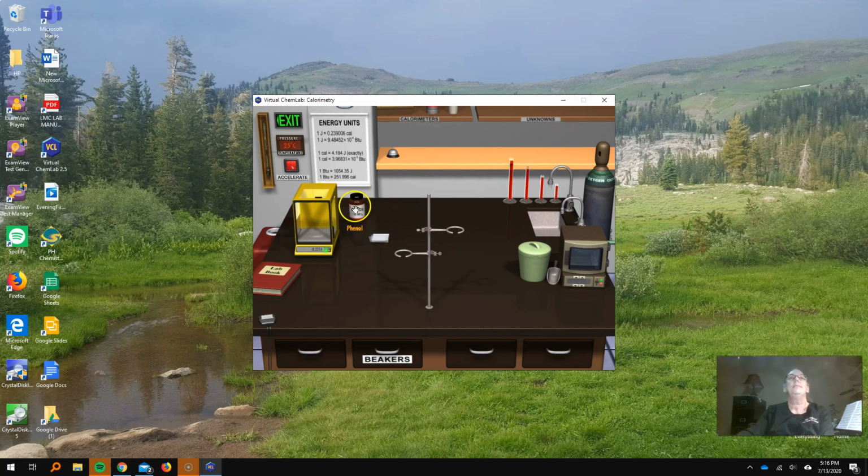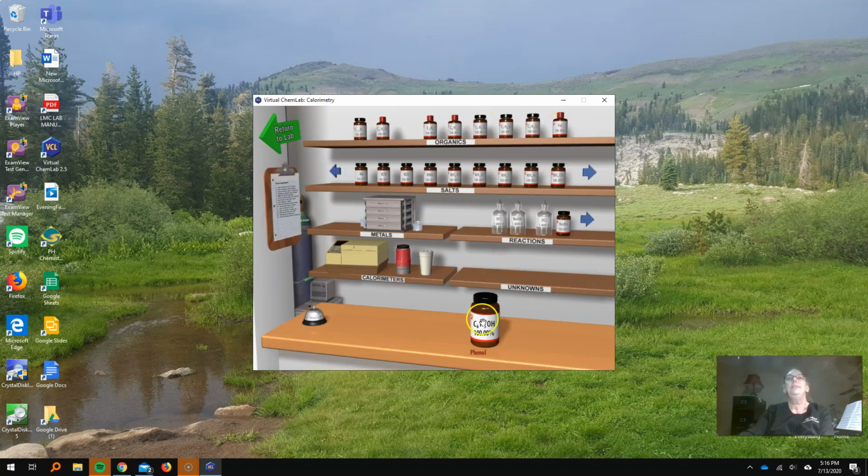Alrighty then. Put phenol back where it goes. And who shall we check? What should we do? Chicken fat. Wow. Okay. Who do we like? Ooh, naphthalene is mothballs. Let's try that guy. It smells really weird.